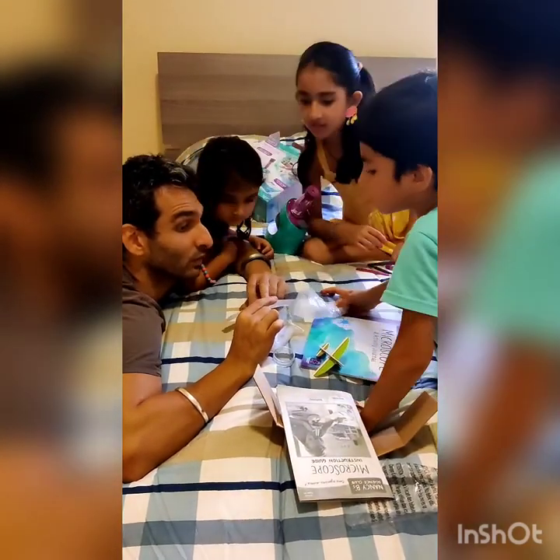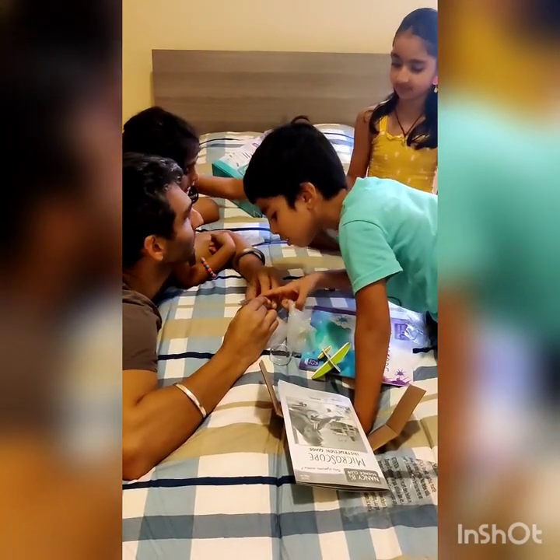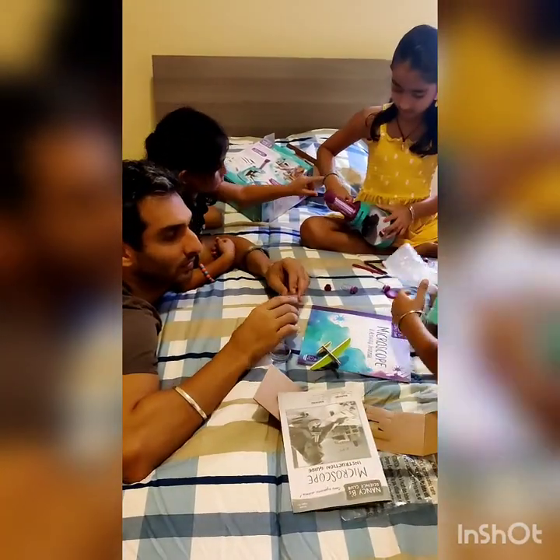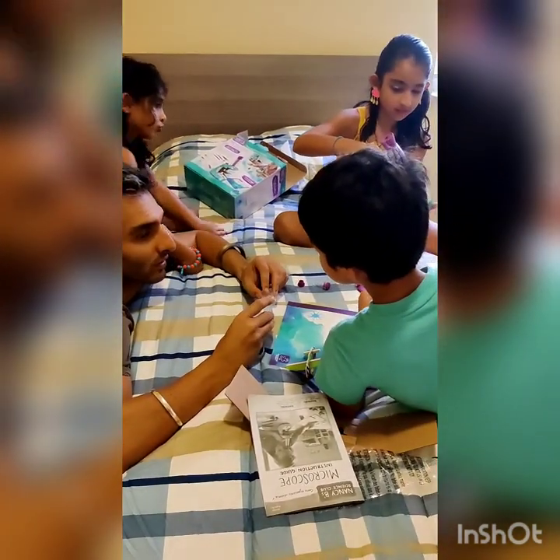Now you'll see this big. It'll look giant. 400 times. Can I see this? What is that? You have to put batteries in it. I want to see the fish scale. Fish scale, right? And then you can make your own slides. So these are the general slides, which are not like you have to make your own.